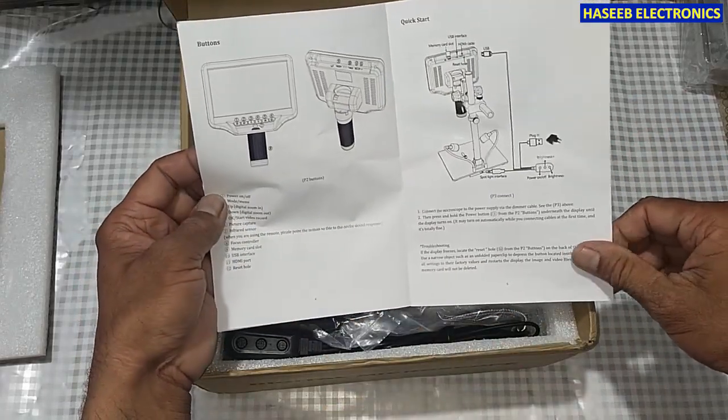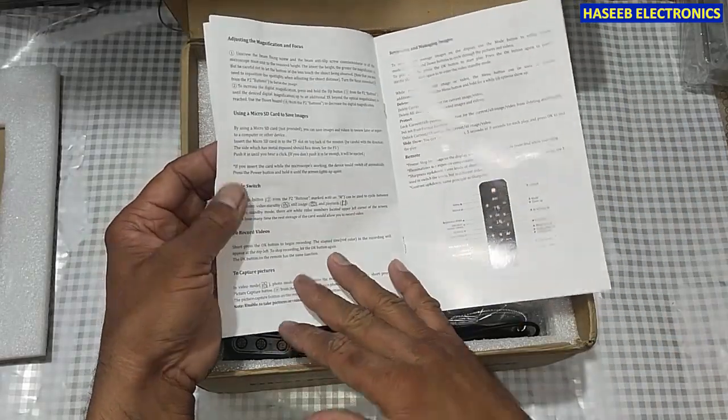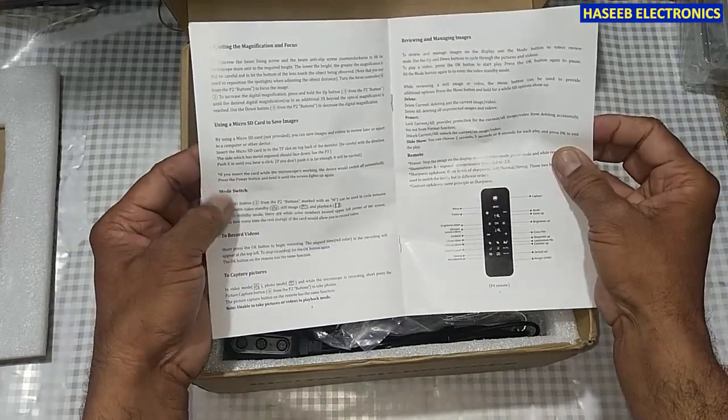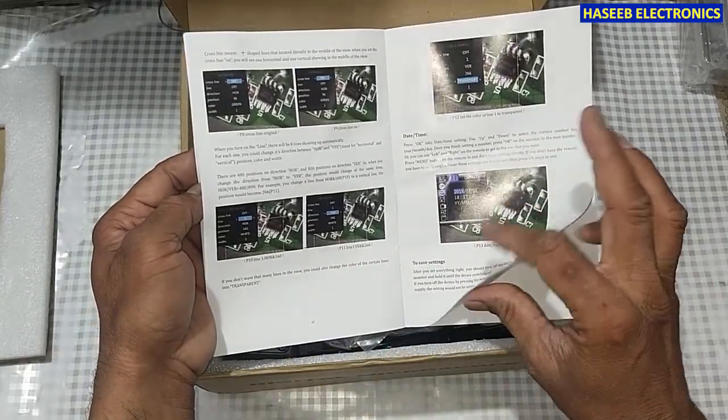It includes different accessories, controls and functions, a remote control, its operation modes, and grid line options.